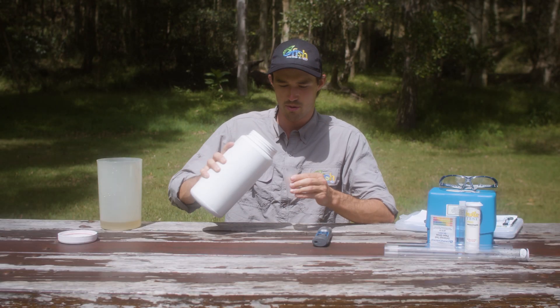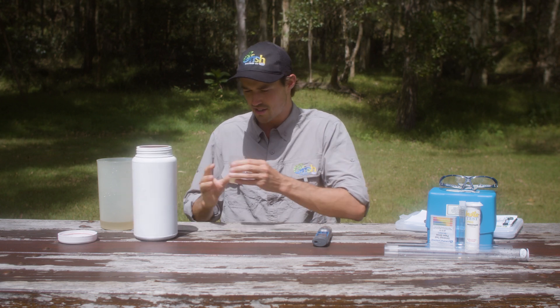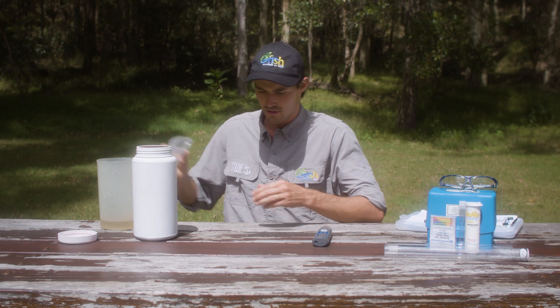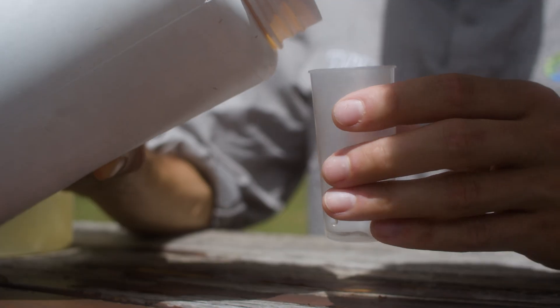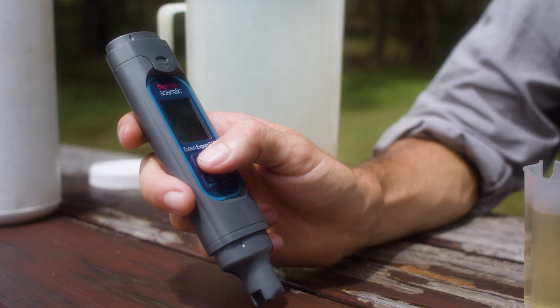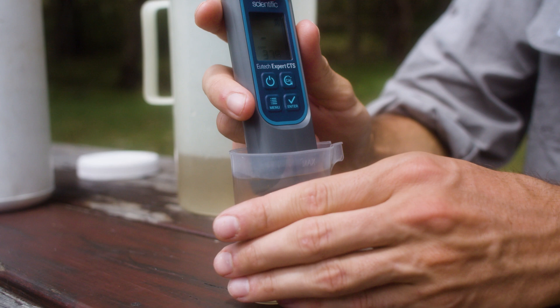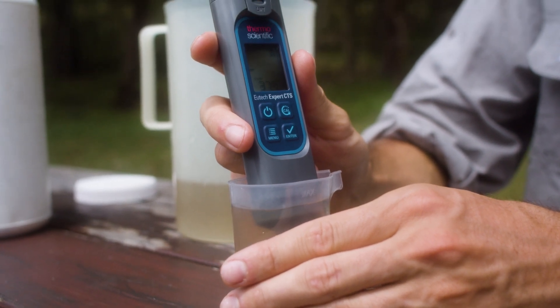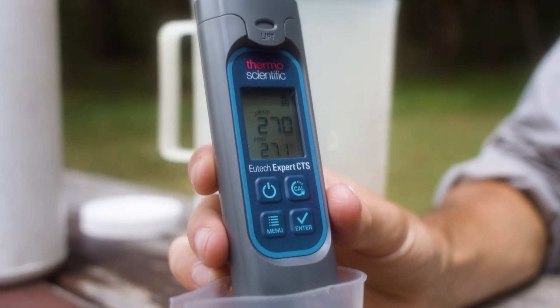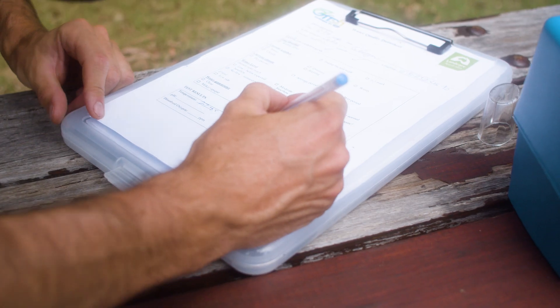To do the test, first grab the plastic beaker and fill it with the sample water. Rinse it a couple of times to remove any contaminants and equalise the temperature, about three times. Once done, take the digital probe, turn it on, take the cap off and insert it so it's about three centimetres deep into the beaker. Now look at the display and wait for the tick to appear — that tells us the reading has stabilised and we can take our measurements.